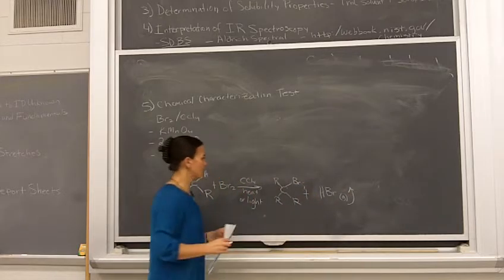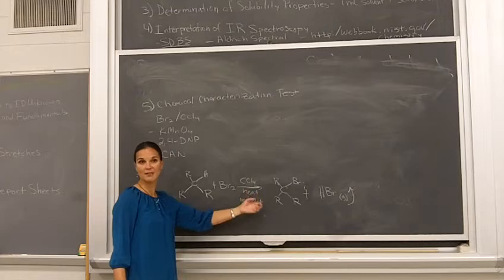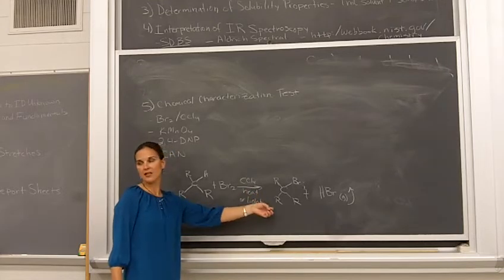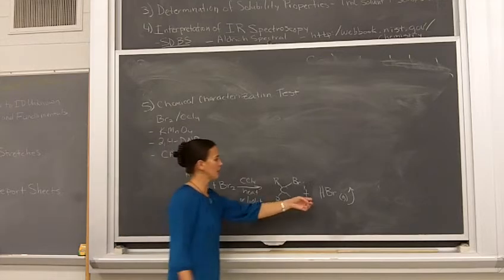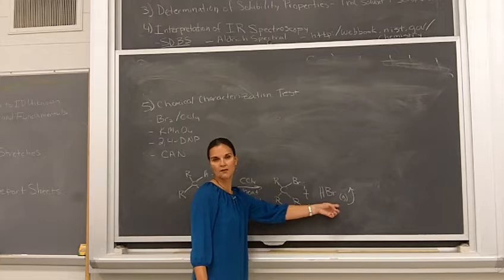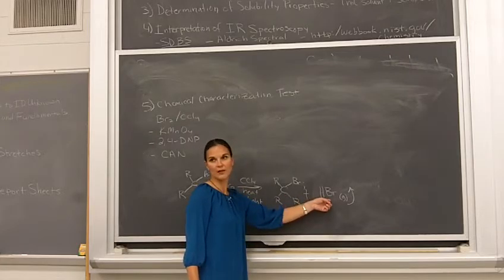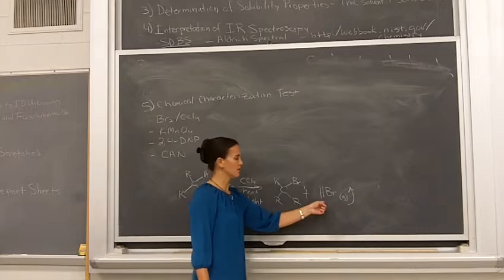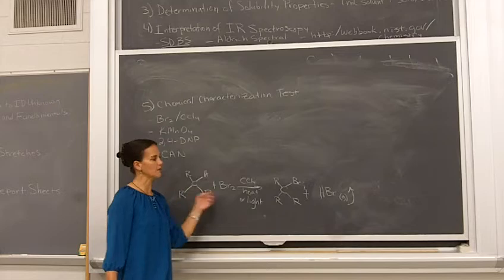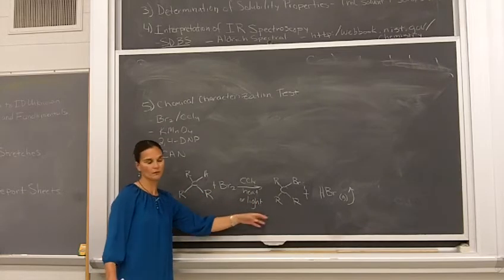All right? And so it tells you when you do the bromine test to also make sure you're testing the pH as the reaction is occurring. This is why: if it's an alkane, then you'll get a reddish color on your pH paper, meaning that you probably have generated HBr instead of it reacting with an alkene, okay? So this is a false positive test, because you're not looking for this result, you're looking for it reacting with the alkene, all right?